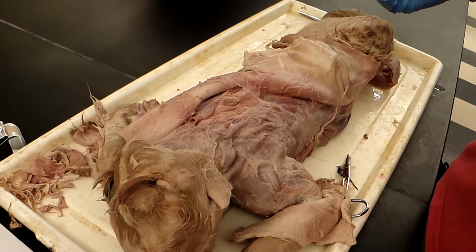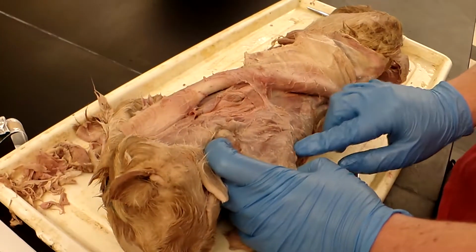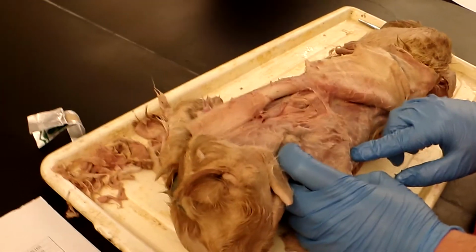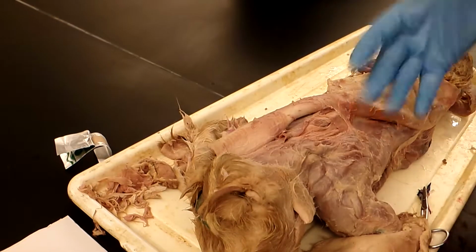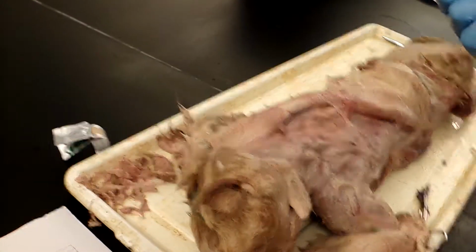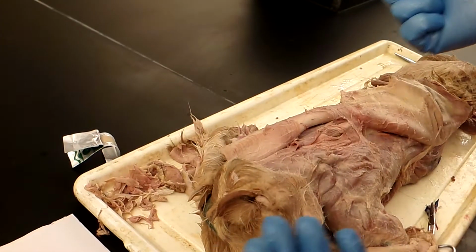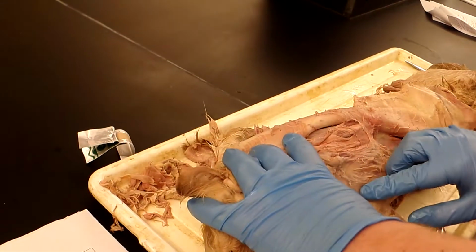Next, the teres major is located right here. The origin is the scapula, the insertion is the humerus, and the function is to flex and rotate the humerus. Next, the levator scapulae ventralis is located right up here.